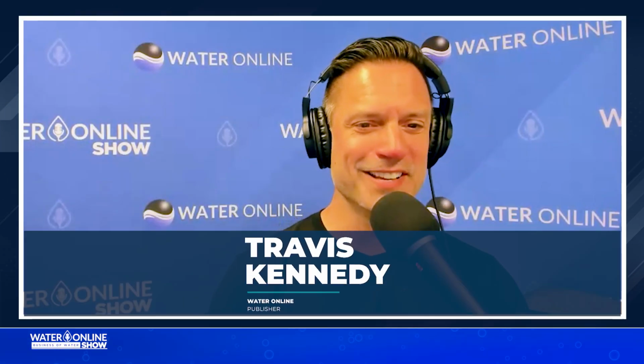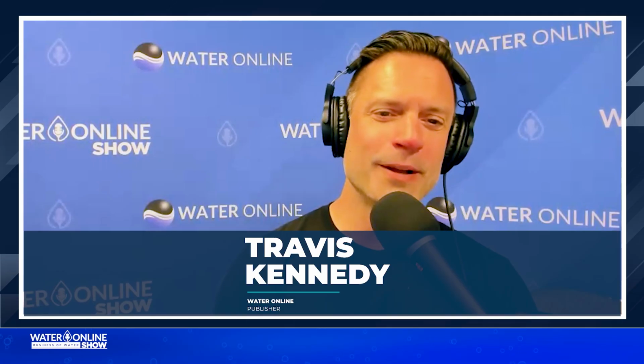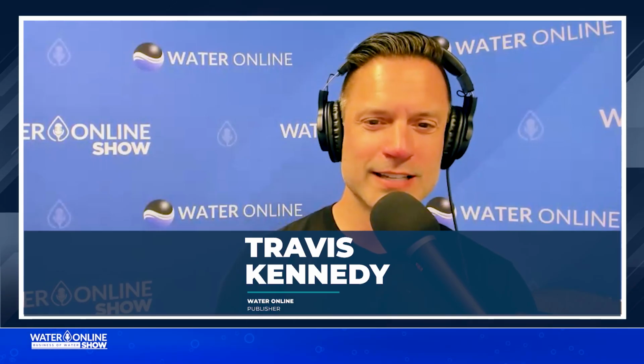And today's episode is all about something you've probably seen on spec sheets, calibration reports, and instrumentation data, but may not fully unpack every single day, and that is limit of detection, or LOD. What does it actually mean when an instrument says it can detect down to a certain level? How is that different from limit of quantification, and why does that distinction matter so much, and also matter more than what most people actually think?